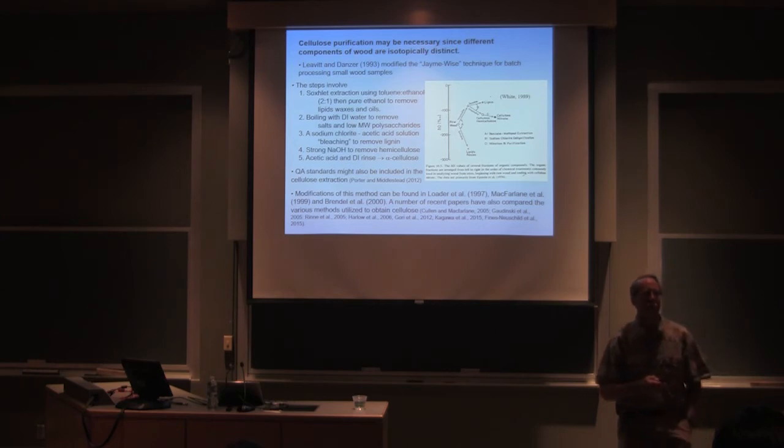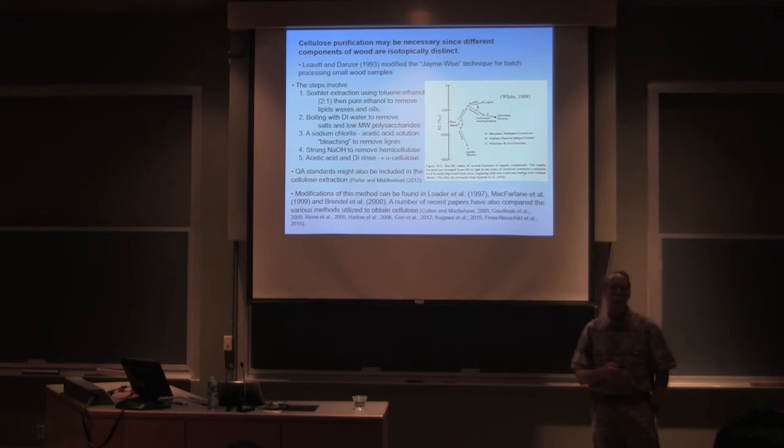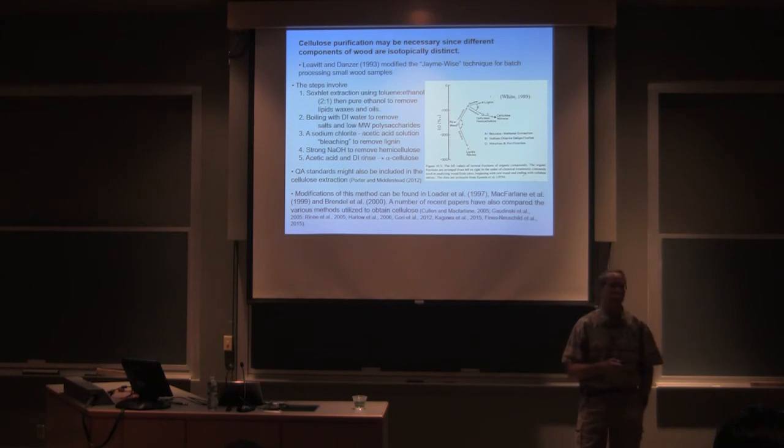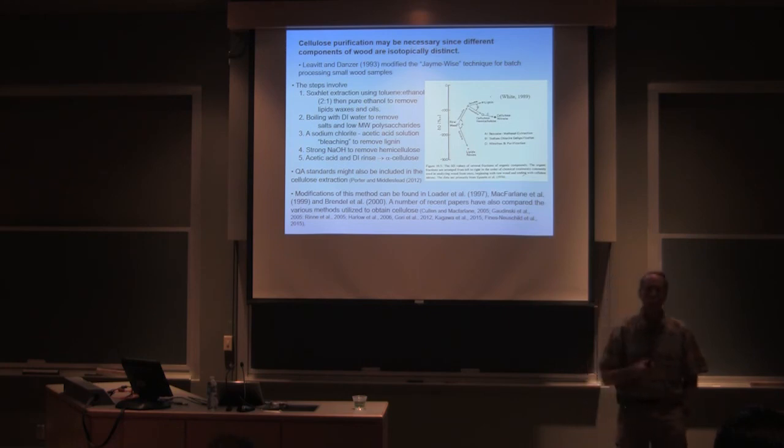Definitely not run on the Picarro, but if you're looking for a water source for these trees, do you have to consider that, if you have really resinous water samples? You probably would do a charcoal extraction. You try to get rid of them, but you would have to consider it if it's high. Most of the time, they're low enough that you don't worry about it. But if you have your water sample and you can smell it, you know what a pine smells like? Yeah, you better do something with it because it could affect your numbers.